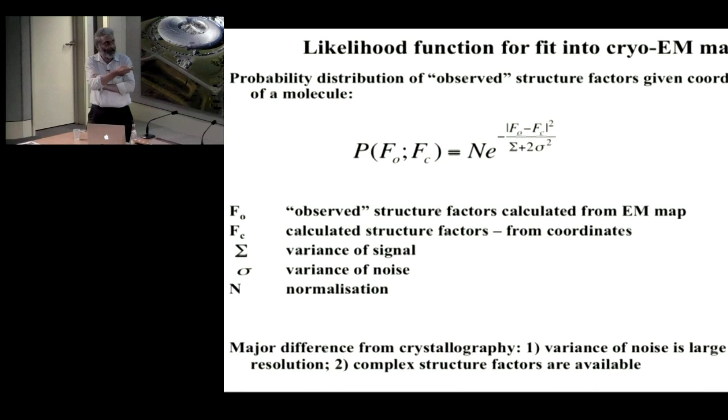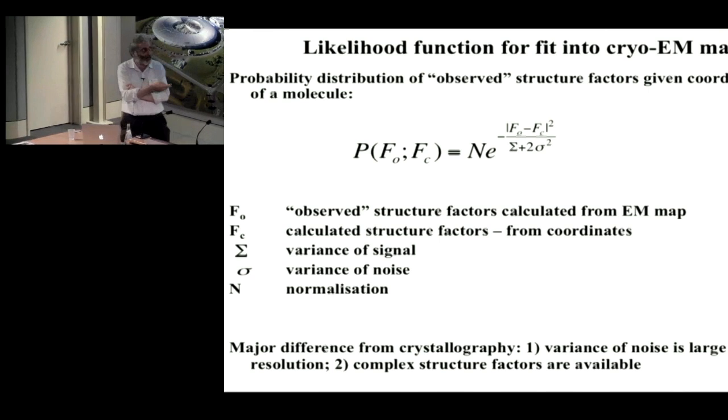One is how well the map describes the model, and the second is what the error in the map is. At the moment, that component is not used. The error in the data or in the map is one way of ensuring that a model is not overfitted into the data. That describes the noise. If you do not have that component, then the model will be fit not only into the signal, it will be fit into the noise also. That is the definition of overfitting.